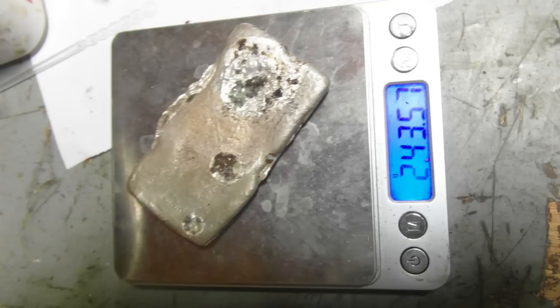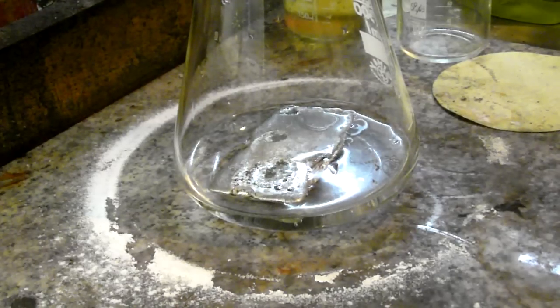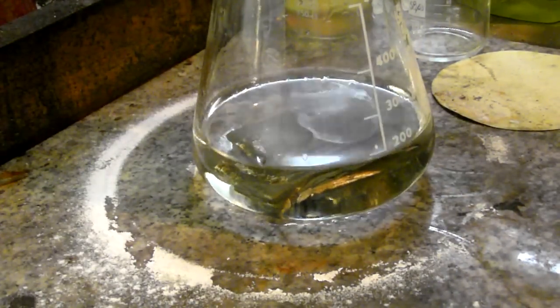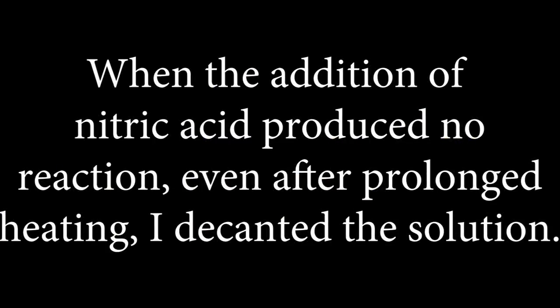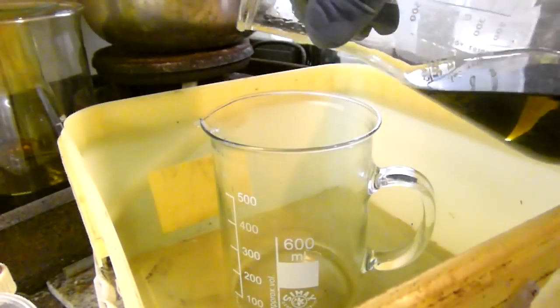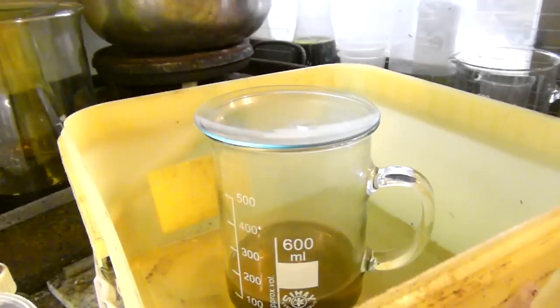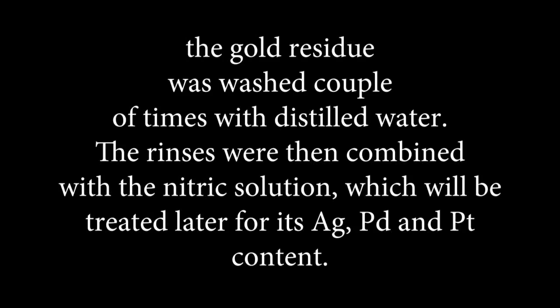243g bar. The bar was digested in nitric acid. When the addition of nitric acid produced no reaction, even after prolonged heating, I decanted the solution. The gold residue was washed a couple of times with distilled water. The rinses were then combined with the nitric solution, which will be treated later for its silver, palladium and platinum content.